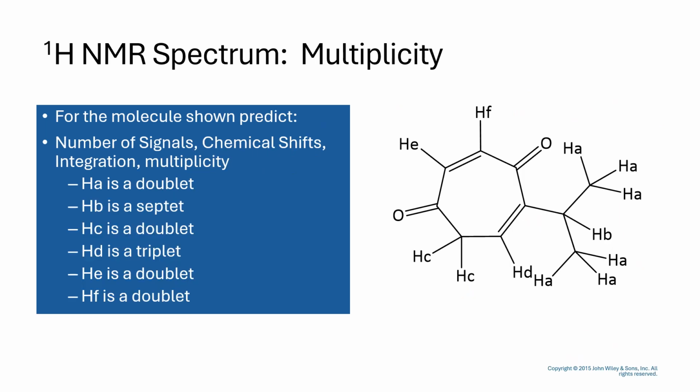Okay, so this is much more complex. But again, you may be given just a drawing with the skeleton, so not the H's. So your first step should be completing and adding all the H's. So you may see again this drawing as much more simplistic.